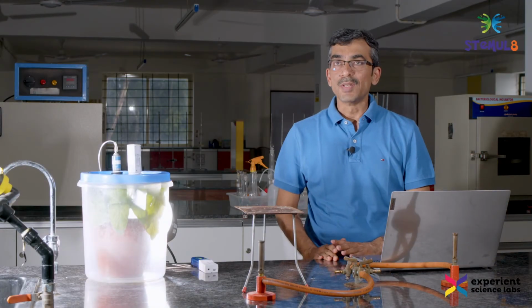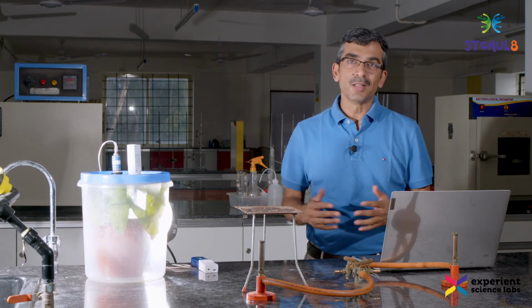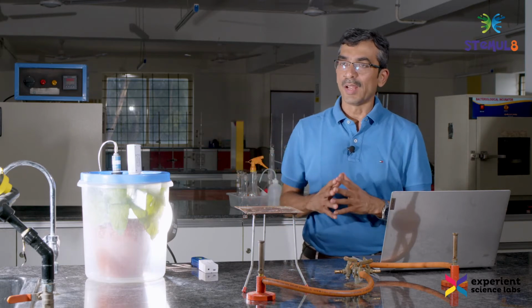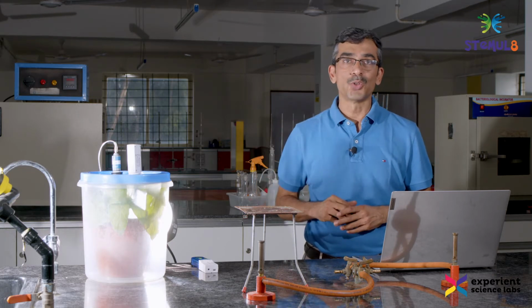Hello friends, we are back once again with another interesting experiment, and this time it's about biology. But if you look at the setup around me, it's very different from what we have been doing so far. There are lights all around, and it's about light, about how plants use light, about the process of photosynthesis.